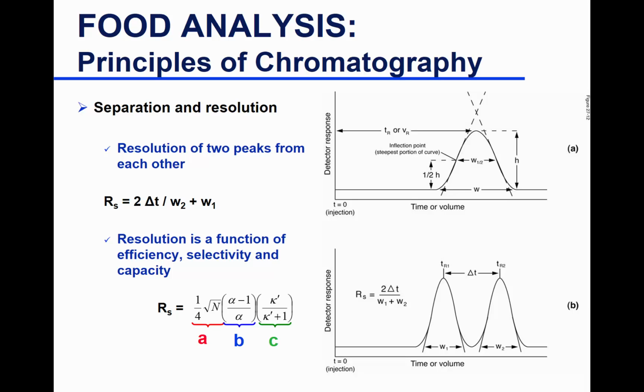If it's a sharp peak, you have very good resolution between two. If they're large, you might have an overlap. They're diffused into each other. So you will end up with something like this, two peaks that co-elute because they both diffused quite a bit. But when they're sharp, you'll have very nicely resolved peaks. They don't diffuse so much longitudinally, but rather they go in and out and equilibrate between your stationary phase and the mobile phase, and then they move in very tight space.